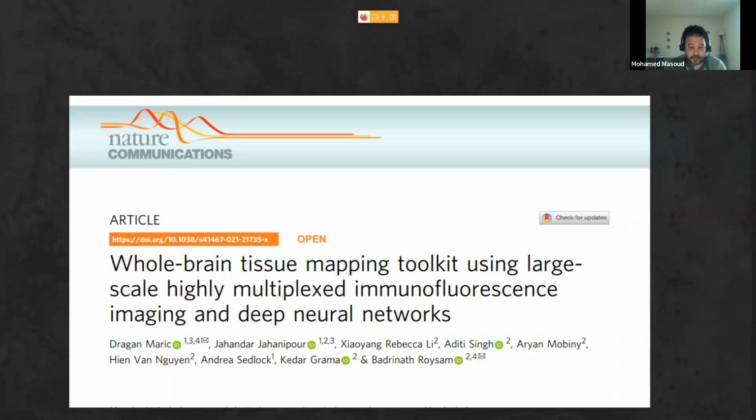The authors also provide a sample preparation protocol, and they show the whole pipeline until they get their tissue ready for analysis.